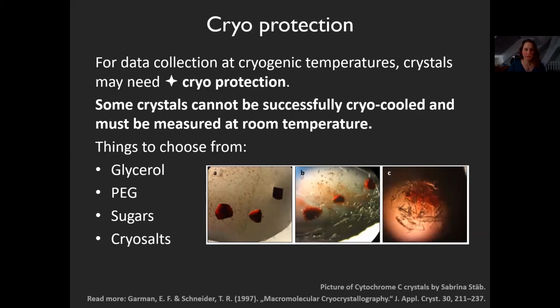Here's a picture from Sabrina Stebb's bachelor thesis in my group. What you can see is perfectly neat looking cytochrome C crystals, which she got after a lot of work. And then she added her cryoprotectant. And this picture was taken approximately 2 seconds after she added that first little bit of cryoprotectant. And that was the crystal after 2 seconds.